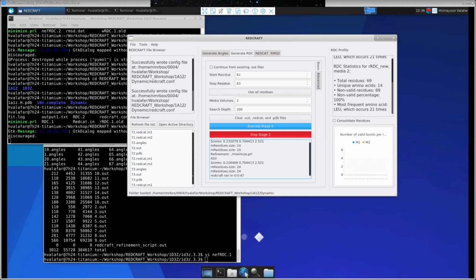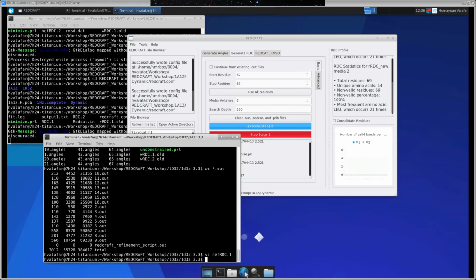I have a question about when you referred to the underdetermined problem. Can you repeat the last part of your question? You were referring to, if I heard you correctly, the number of RDCs per residue that are required to have a determined, an overdetermined, and an underdetermined problem. So the minimum is 2 RDCs, otherwise it's undetermined, correct?